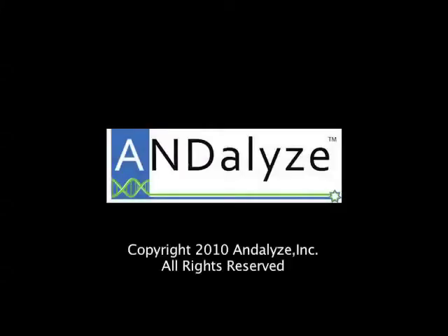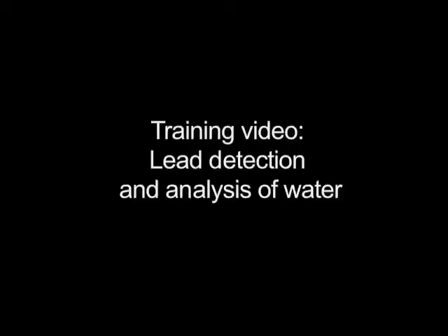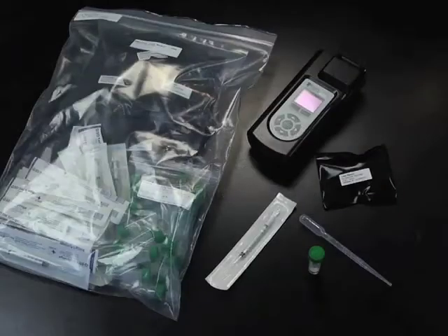Analyze real-time testing powered by DNA. This video shows the process for lead detection and analysis of water using the Analyze fluorometer and heavy metal sensors.